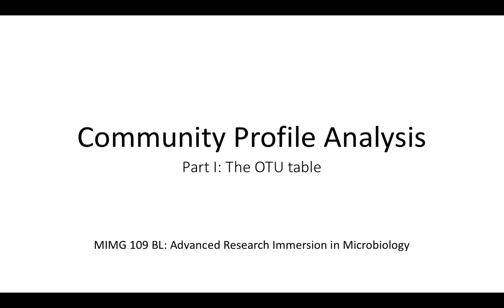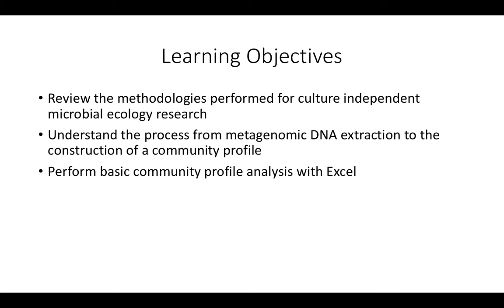This first video is on the OTU table. In this video, we will review the methodologies performed for cultivation-independent microbial ecology research. By the end of this video, the student should understand the process from metagenomic DNA extraction to the construction of a community profile, and then should be able to perform basic community profile analysis with Excel.